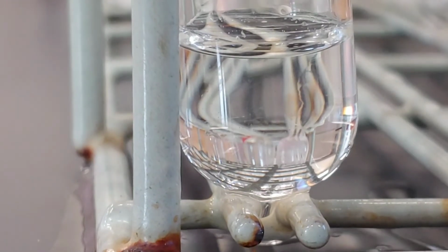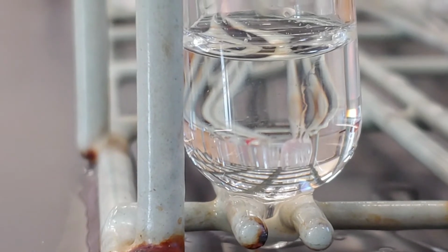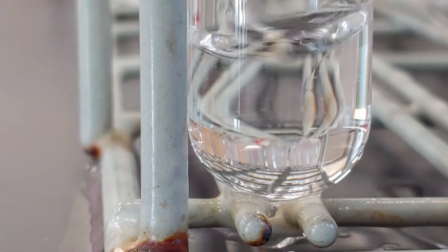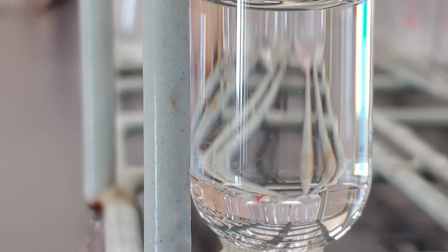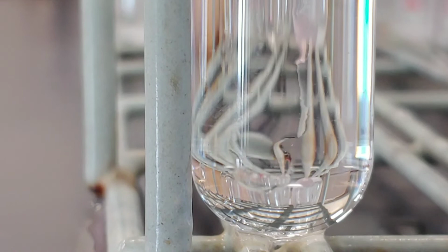Okay, reaction number 12. This one, watch closely. This is aqueous sodium chloride plus aqueous potassium nitrate. Okay, there you go. Did you see it? Yeah, no, me neither. There was no reaction.